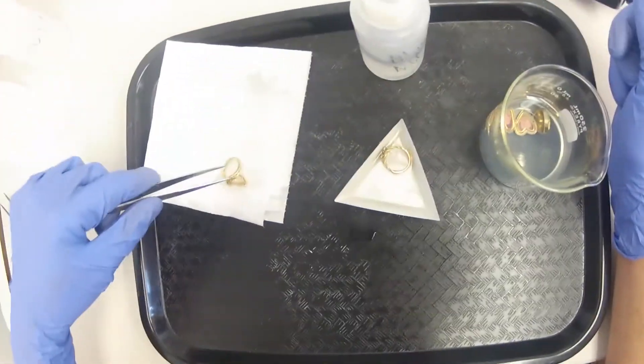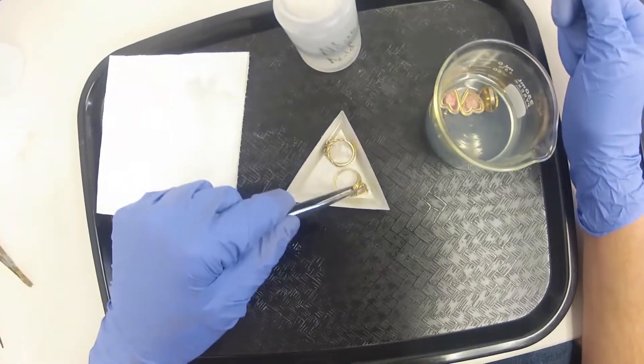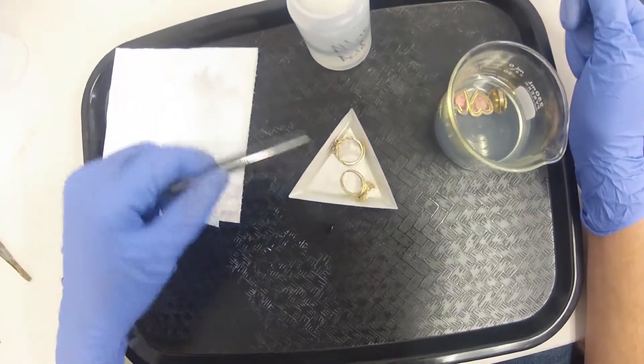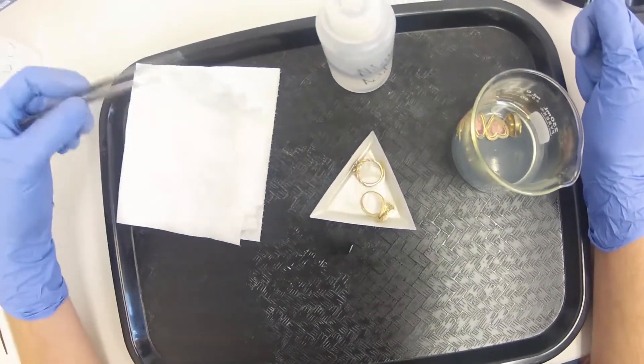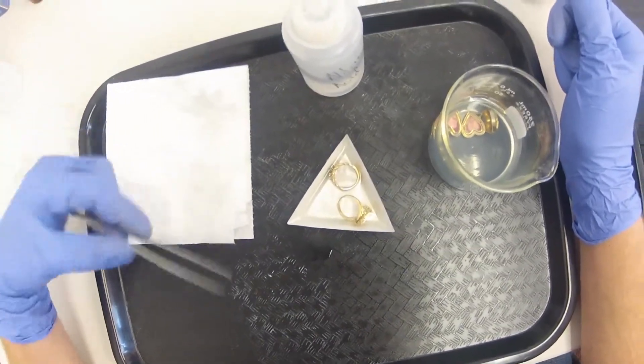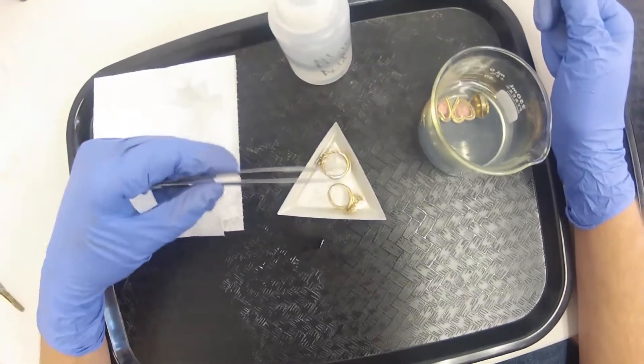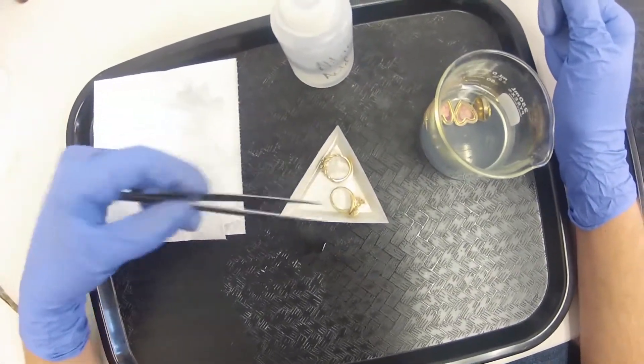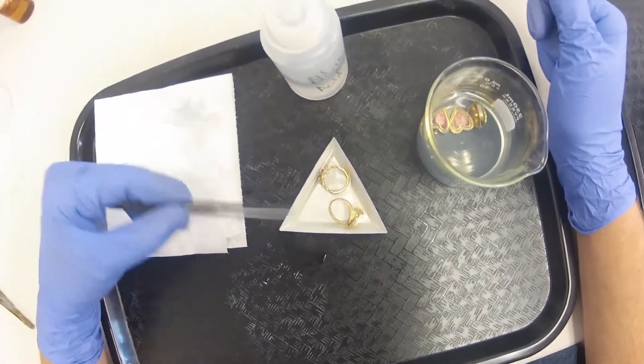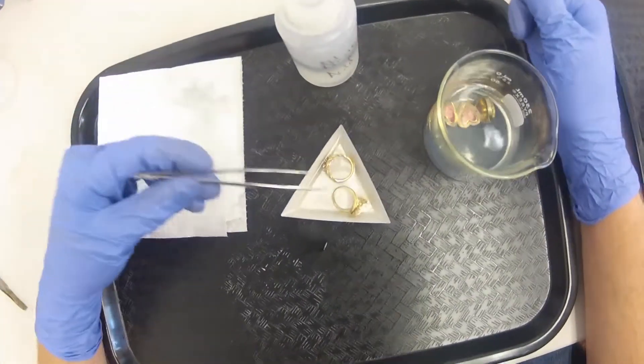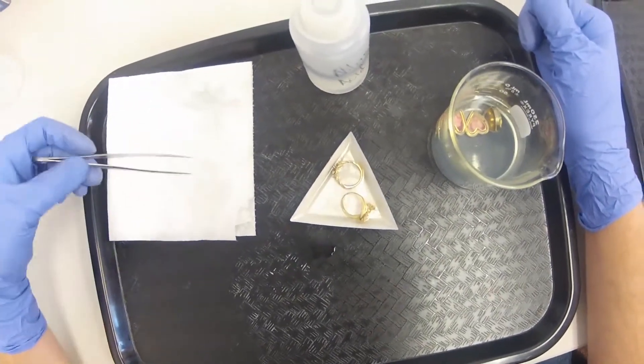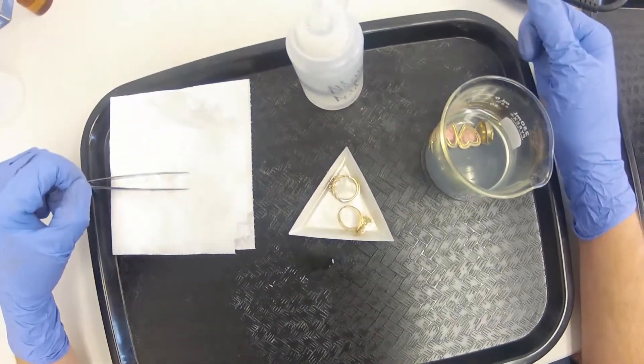So gold is non-reactive to nitric acid, but the base metals that the gold are alloyed with, each piece here, they're actually alloyed with base metals like copper. So the copper is reactive, and even though it's alloyed with the gold, it is just very slowly reactive now. And we'll come back in a few minutes and I'll show you the difference between the 10 karat and the 14 karat.